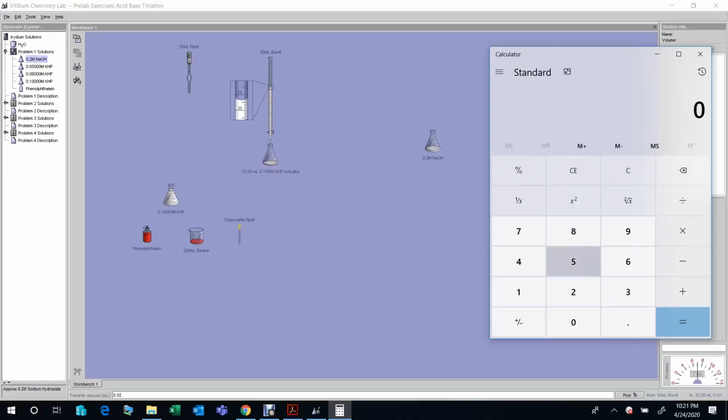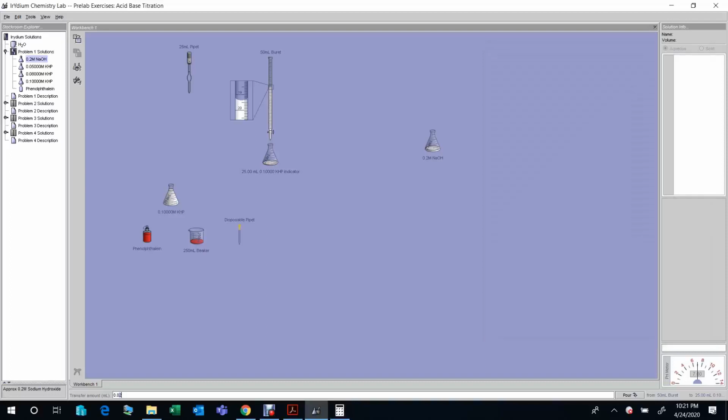Okay, and then 19.4 minus 6.9. Oh, exactly 12.5 milliliter. If you're not sure, then we can add another 0.02. I feel there's some color change already, but if you're not sure, this very slight color change is good enough. If you're not sure, then we can add maybe 0.01. Let me see. We can add 0.01.